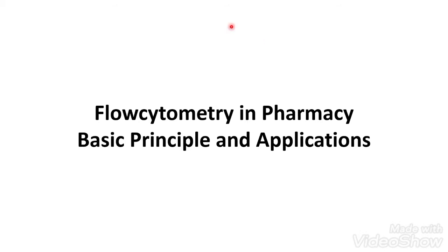and I have kept my presentation as student-oriented and as simple as possible, because I personally believe that we should discuss the science which we can explain to students in the simplest manner possible. So we'll go through the principle of flow cytometry, how the system is working, how the technology is working, and then we will see some very interesting applications.